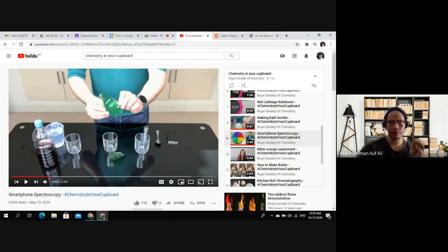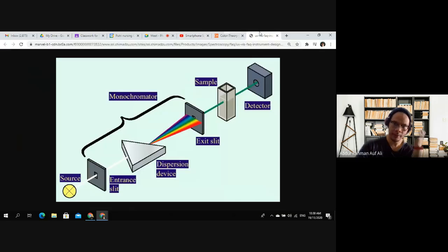So the green wrapper yang diguna dekat dalam video YouTube ni functions as a monochromator. Dia pilih just one color from the light source which has all of the colors of the rainbow. Bila dia lalui wrapper warna hijau ni, spektrum color yang warna hijau saja yang akan dipancarkan, because warna-warna lain sudah diserap oleh this color wrapper. Okay, so bila dia dah lalui our sample solution ni, our solution akan absorb that light.